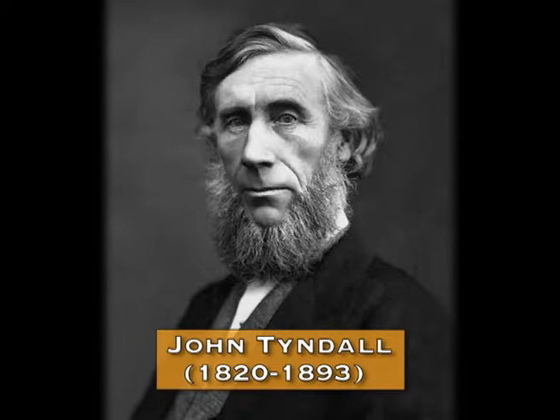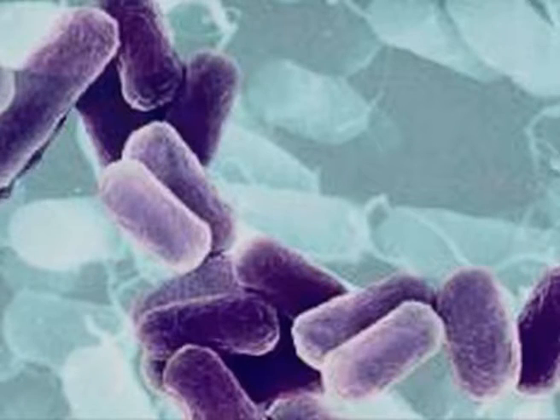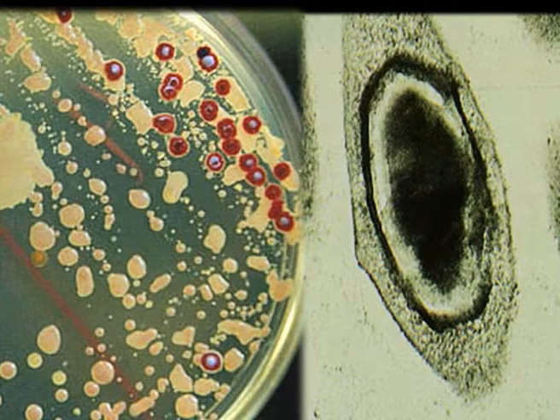Fractional sterilization or tyndallization. This method was developed by John Tyndall. In this method, steam is allowed to sterilize a liquid, compounds or other objects, but this process is carried out on 3 different days. On the first day, we carry out the steaming process at 100 degrees centigrade, followed by incubation of the sterilized material. During the first course of sterilization, all the viable microorganisms are killed. Only the spores escape killing.